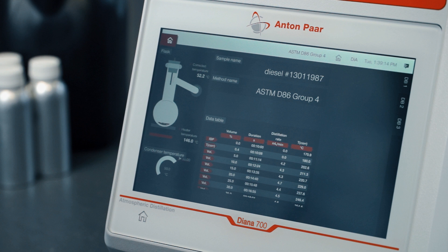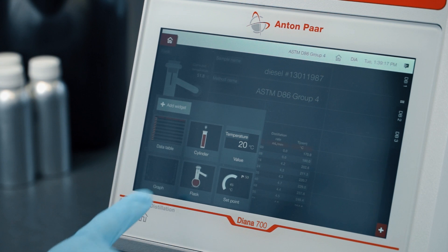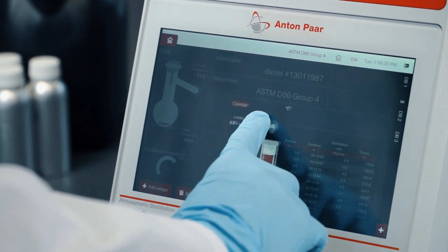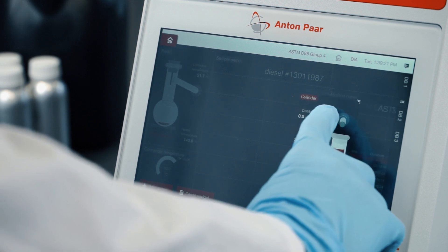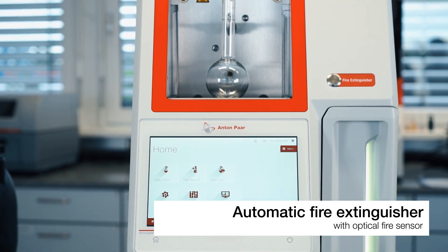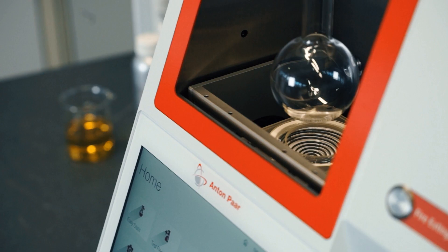The innovative software with a flexible user interface gives you all the possibilities. Easily create individual measurement dashboards to observe all necessary parameters at a glance. Diana 700 meets the highest safety standards in distillation to guarantee safe operation.